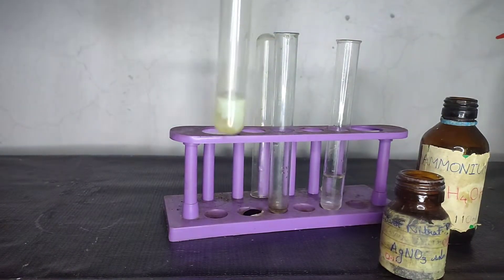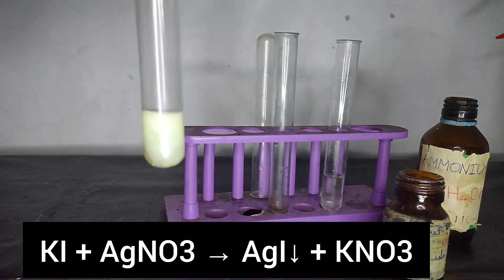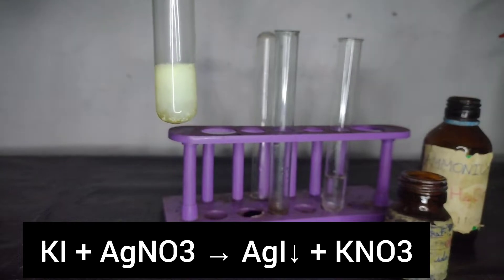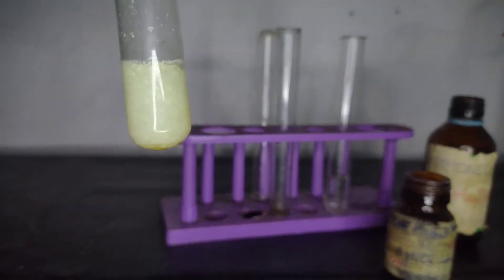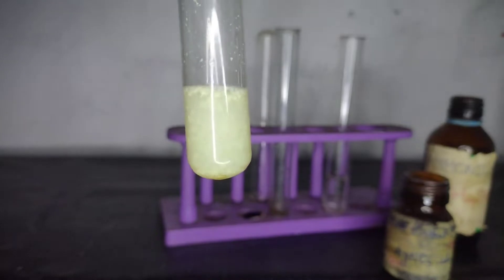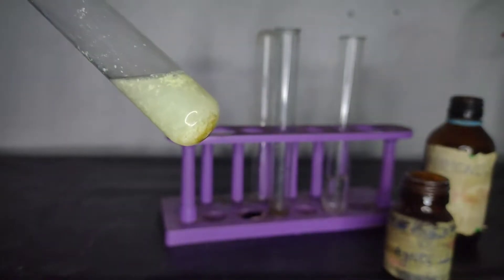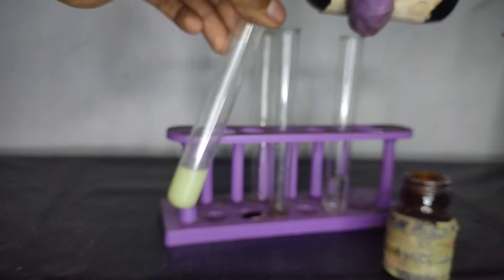On adding silver nitrate, you can see that there is the formation of a yellow precipitate. It is much yellower than the silver bromide and also it is insoluble in ammonium hydroxide.